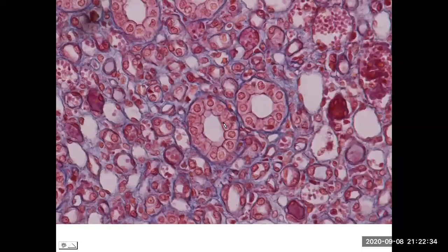The next sample here, we're looking at simple cuboidal. And in this case, I'll make a little sketch again. You have to imagine we have a tubule. And now the entire tube itself is made of these cuboidal cells. So if I draw a bunch of little boxes, these are cuboidal cells. And you notice cuboidal cells have a rather large, centrally located circular nucleus.